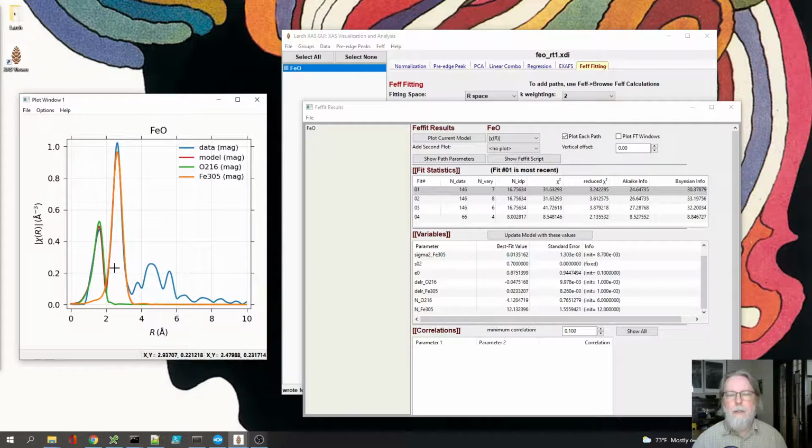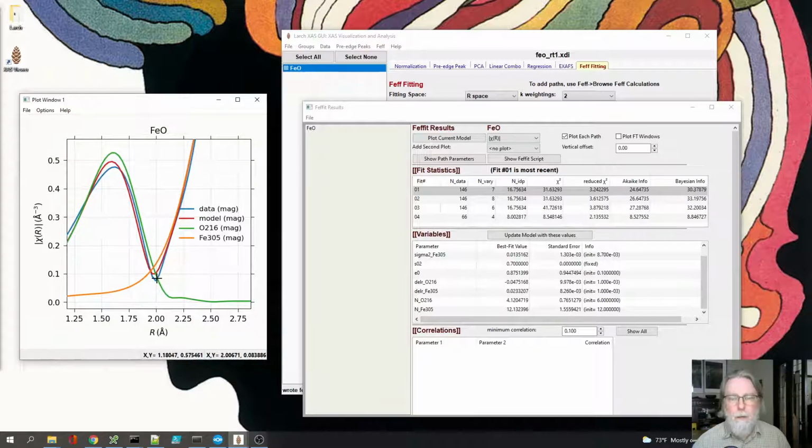So I would be willing to say that we have the oxygen pretty well in hand, although it didn't turn out as great results. But for the iron, in order to get the iron scattering, I might want to have at least some small model, even if it's all fixed, of what's happening above that portion of the spectrum to get that well. We'll come back to this in a bit. Sometimes those dips in the spectra really are where the spectra are fully separate, and sometimes they aren't. So I think that I'll leave it there.